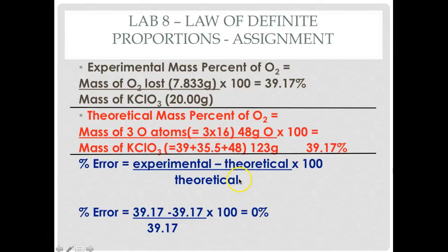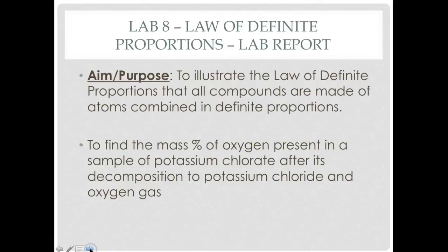Now, this is an absolute value because this is a percentage, and this is also a percentage, okay. So there's no plus or minus, whatever number you get is always going to be positive, an absolute value, okay. All right. So in my case, it's 0% because both theory and the experimental value match.